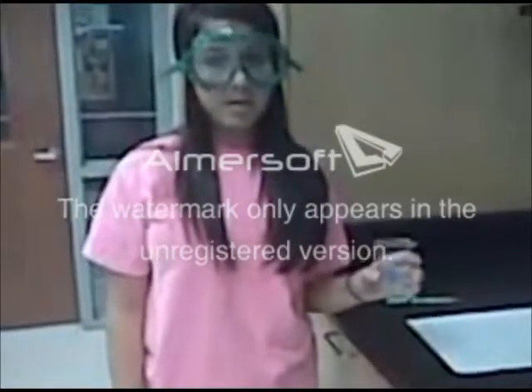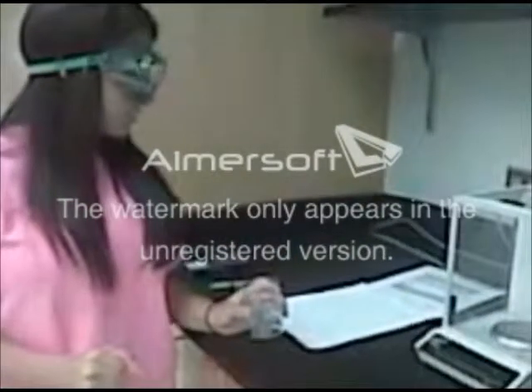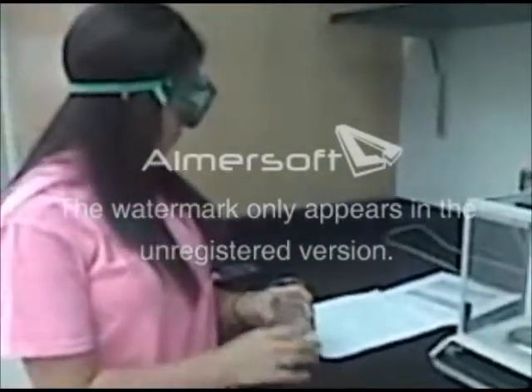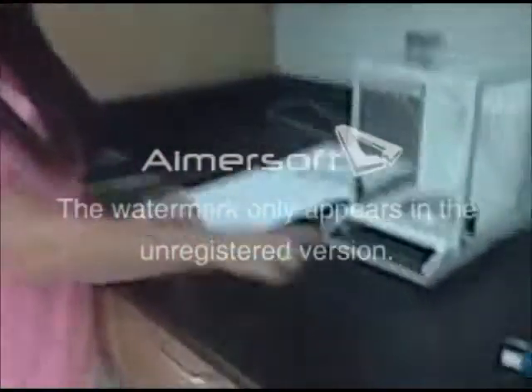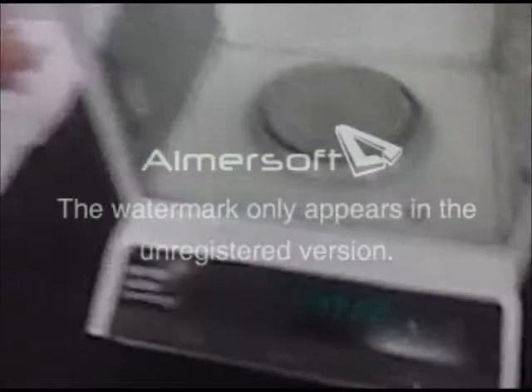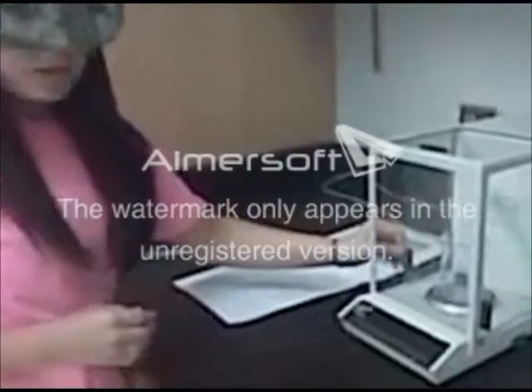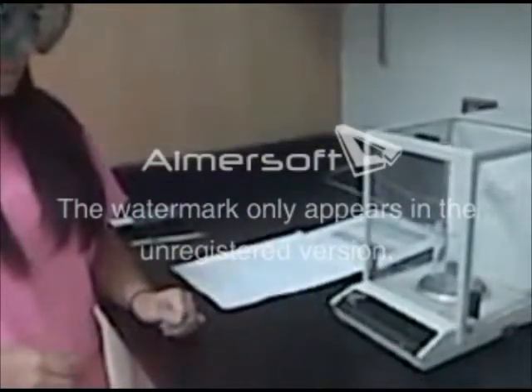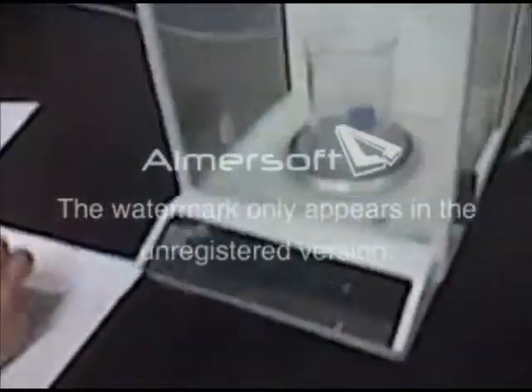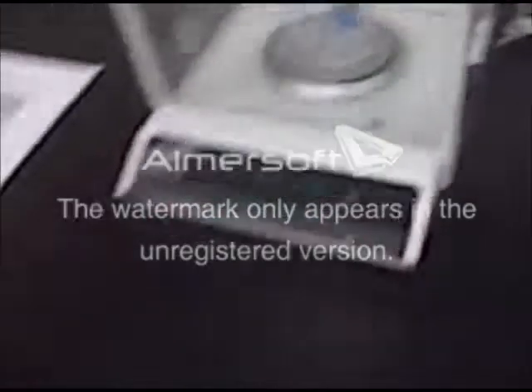Now we're going to weigh our beaker in the analytical balance. The analytical balance is more accurate and sensitive. First, you're going to want to make sure that the balance is zero. We're then going to add the beaker. You can close the window. Perfect. And then you record how much the beaker itself weighs. It's going to be 66.169.